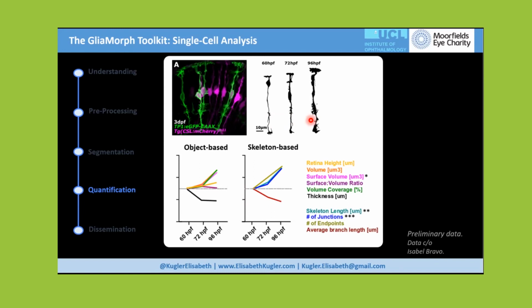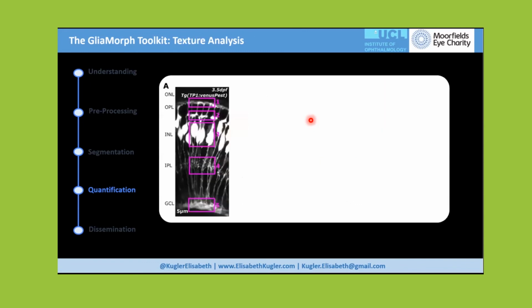But with this, we then also said, okay, this is amazing. Can we now look at our data from a very different perspective and actually look at it from a perspective of image intensity? If we look at a maximum intensity projection, what we see is again these 5 different subdomains. And just by looking at it, what you will appreciate is that, for example, cell bodies are very, very bright, whereas in the IPL, we have a very dim signal.